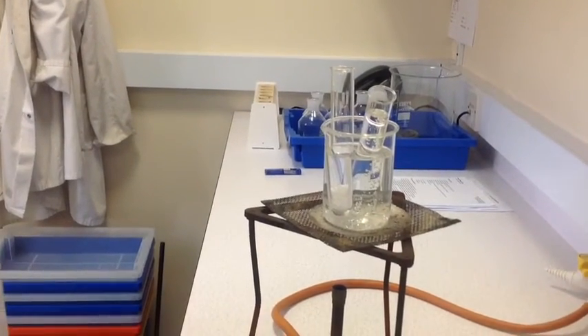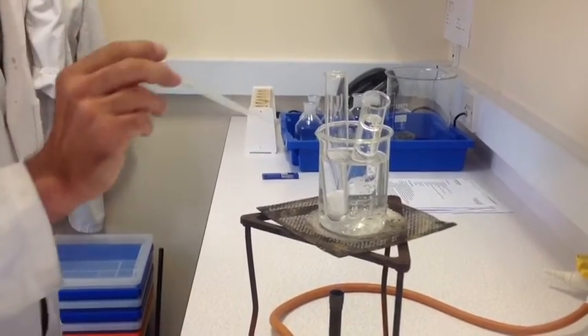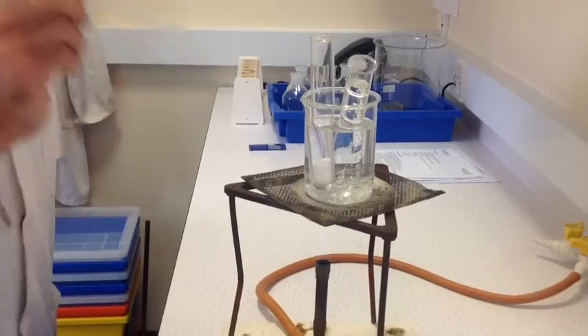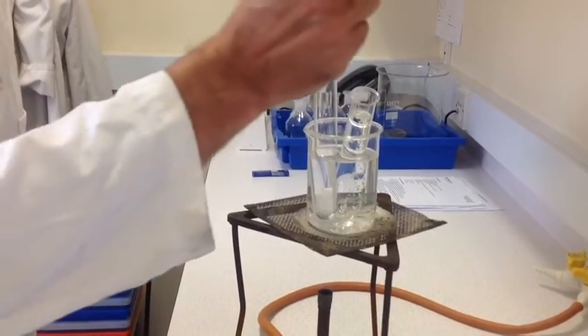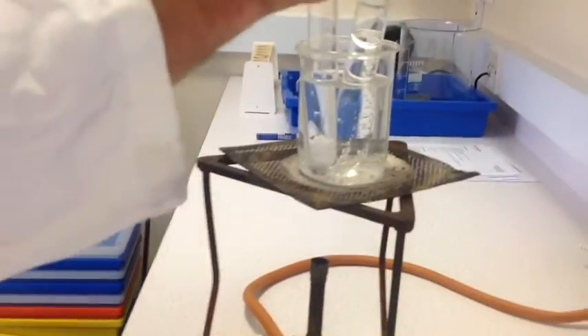So now I'm going to add the hot deionized water into my boiling tube of Benzoic Acid Crystals, a little bit at a time. We want to re-dissolve or dissolve the crystals in the minimum amount of deionized water if possible. So I'll add a little bit.